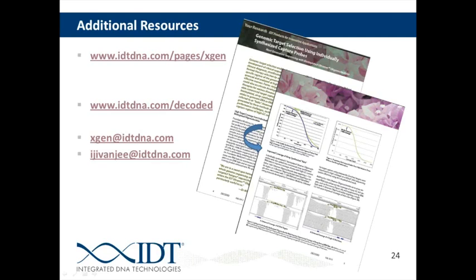Okay. Adam, I'm going to actually give this question to you as well. Can this technology be used to specifically identify RNA viruses that are in a clinical sample? You could. We've worked with several customers who have been interested in enriching for specific pathogens within a host organism. So as long as you know the sequence of the organism that you would like to enrich for, or in this case a virus, you can use an enrichment technique to increase the relative amount of the sequence in there.